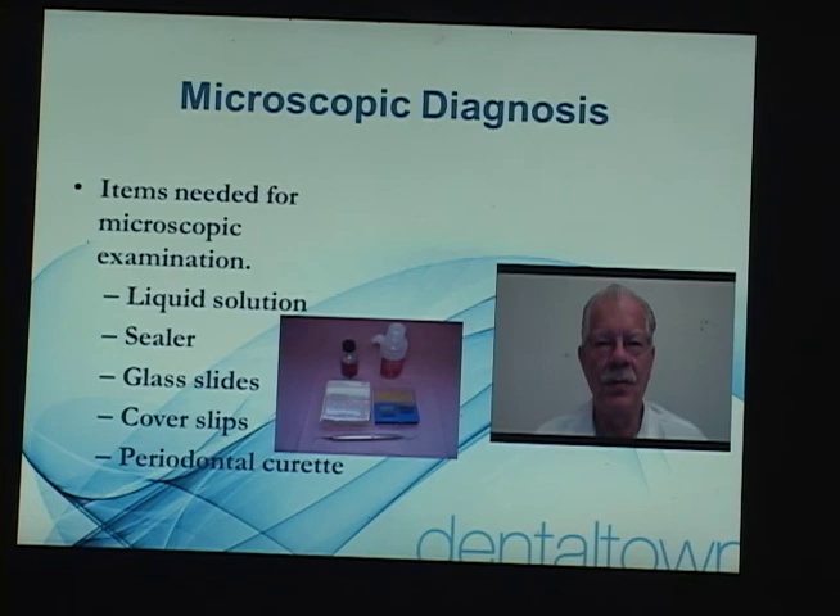Now we're preparing the slide. We put a little solution on there and then we put the sample in the solution and then we place the cover slip on it and then we flip it over onto a piece of towel paper to absorb the excess fluid, and then we seal the slide cover slip onto the slide.